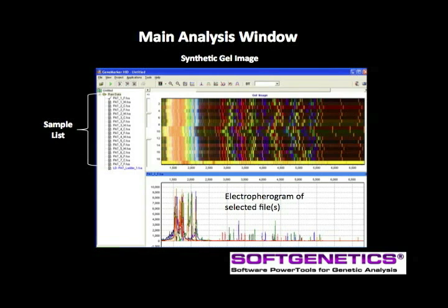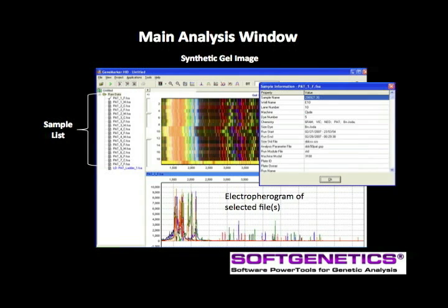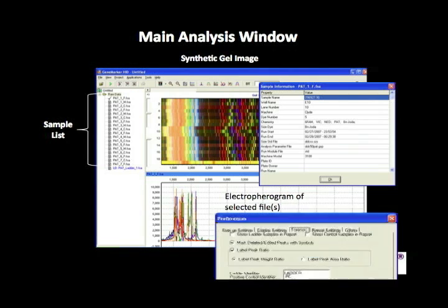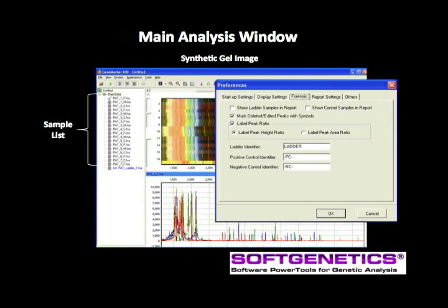The center of the main analysis window screen contains a synthetic gel image and the electropherogram of selected files. The file name tree at the left contains the list of all sample and ladder files. To access sample information from the file, right-click on the file name and select Sample Info. Ladder, positive, and negative controls are identified based on the sample naming conventions. To set these for your preferred file name, click on View, Preferences, and the Forensic tab. In this example, PC is used for positive control identifier, NC for negative control identifier, and Ladder for the allelic ladders.